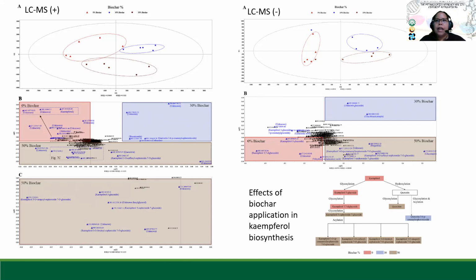Again, we are using a high resolution QTOF LCMS system, so you'll be able to use the accurate mass generated for purposes of identification. We also make use of tandem MSMS. We use information dependent acquisition MSMS for fragmenting these precursor ions, these molecules of interest. From there, you'll be able to confirm what the identity of these ions really is.